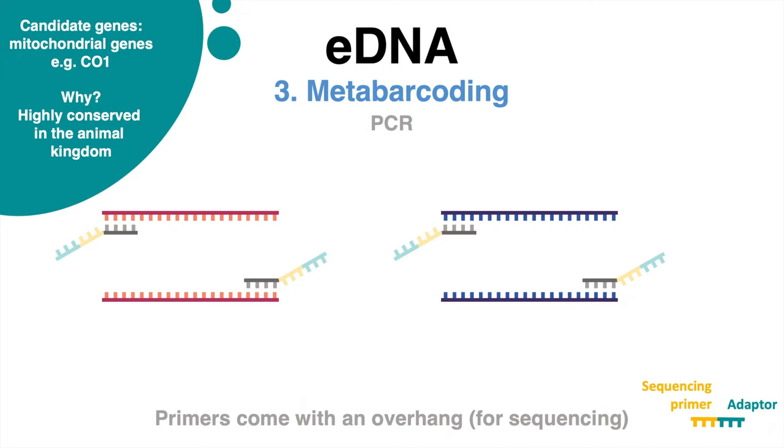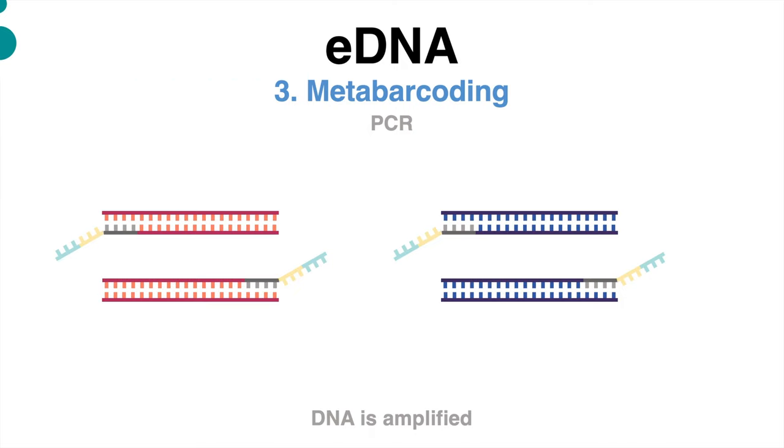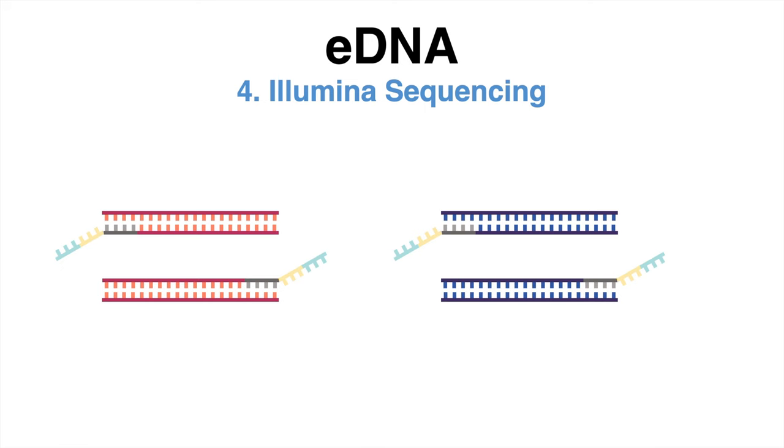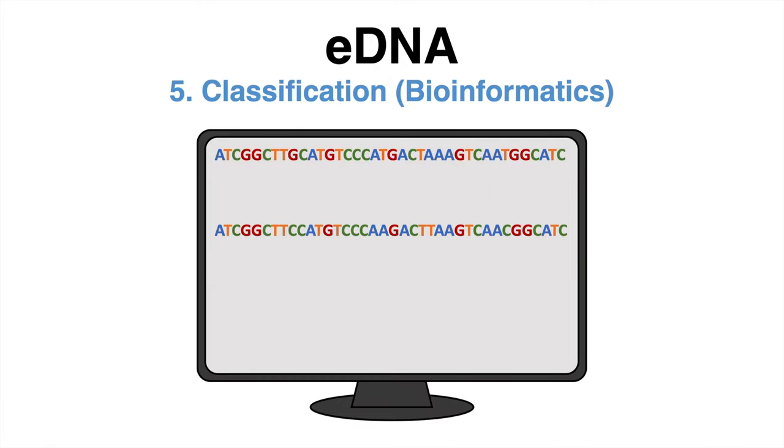In brief, DNA fragments of various organisms are amplified in high quantity, and after millions of amplicons have been generated with PCR, those reads can be sequenced with an Illumina instrument at ease. After some data processing, including different bioinformatics steps such as the removal of primers and unwanted reads, the species can be classified using a database with reference sequences.